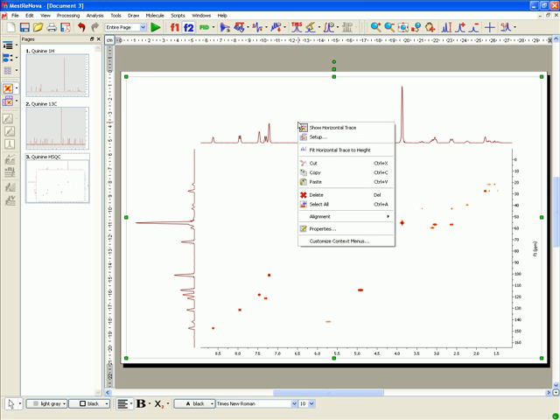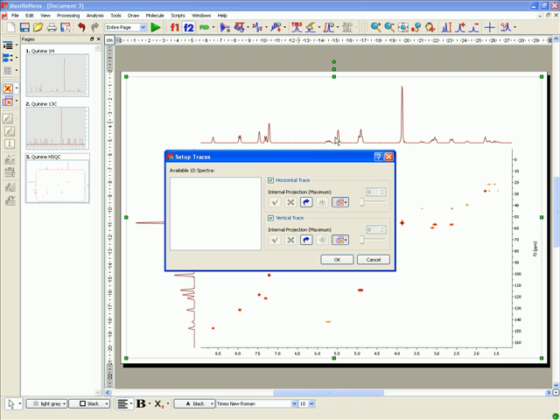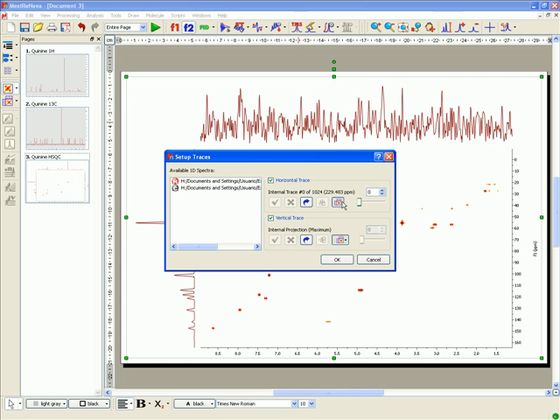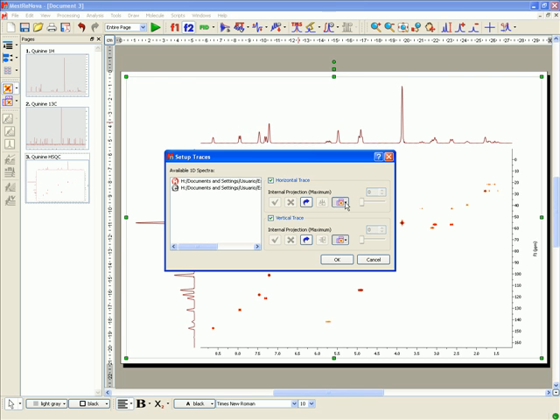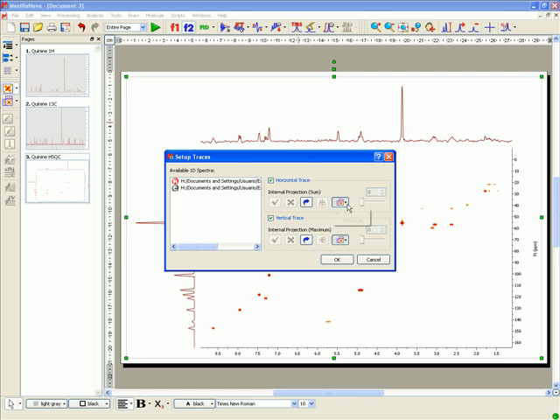It's possible to show the internal projections as either calculation of the sum of all traces across a given dimension, sum, or by computing the maximum of every trace, maximum, just by clicking on the Projections icon.